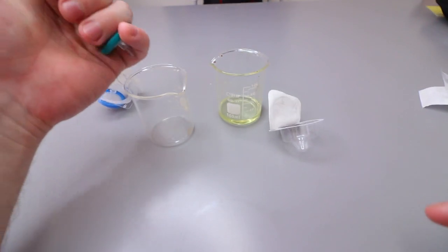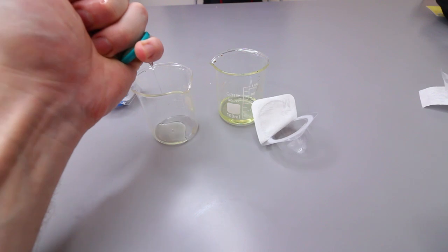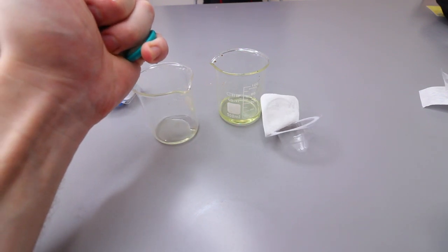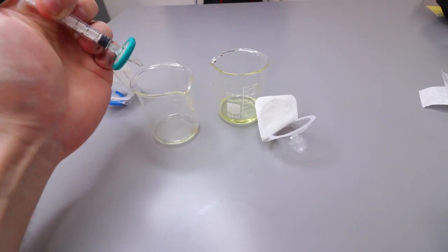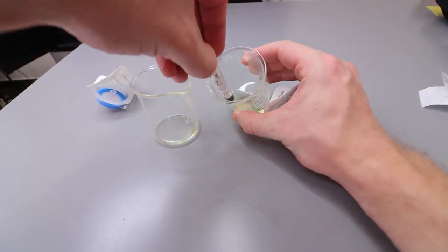Hopefully you guys will be able to see this. When I push this through you can see there it's kind of dripping through fine, there's no real problems there. And now I just want to compare it to the other filter.